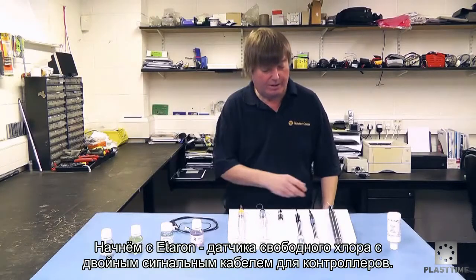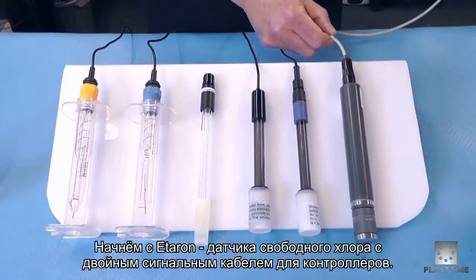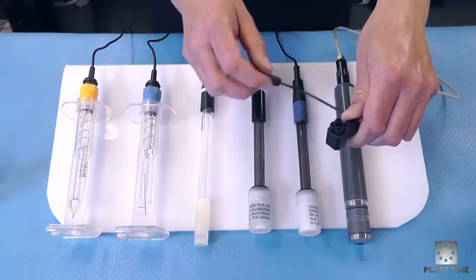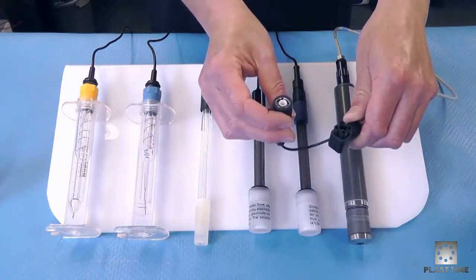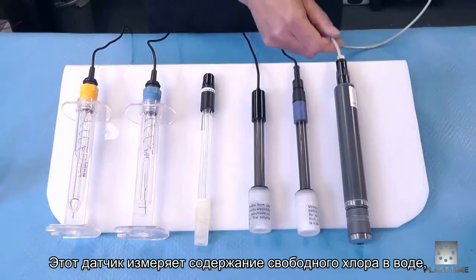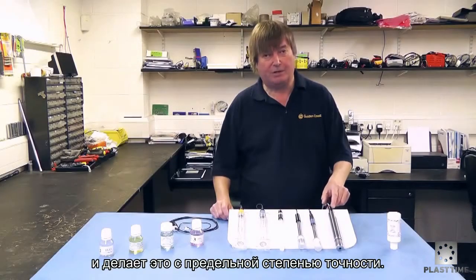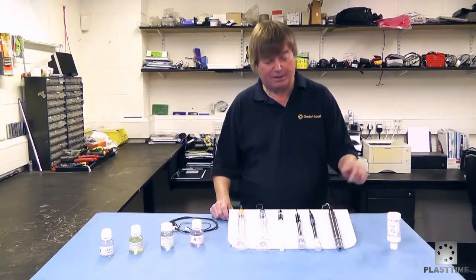Starting with the Etatron free chlorine probe, which has a lead on the end with a plug that goes into the controller and also a signal plug that goes into the controller. This probe measures the free chlorine content of the water, is extremely accurate, and is not affected by pH levels.